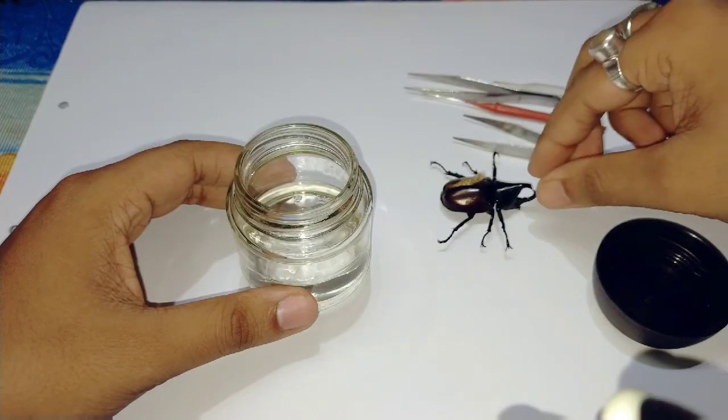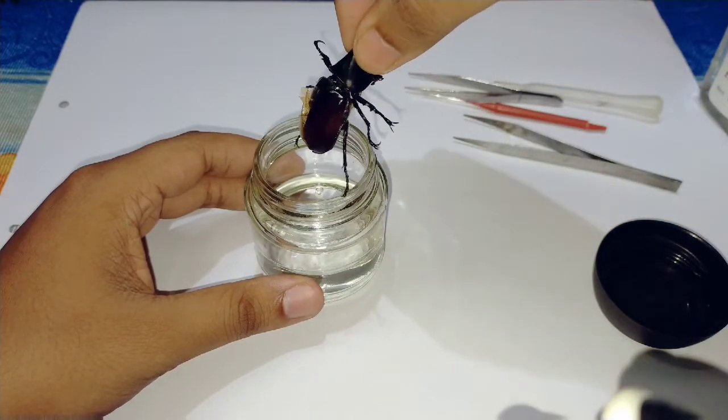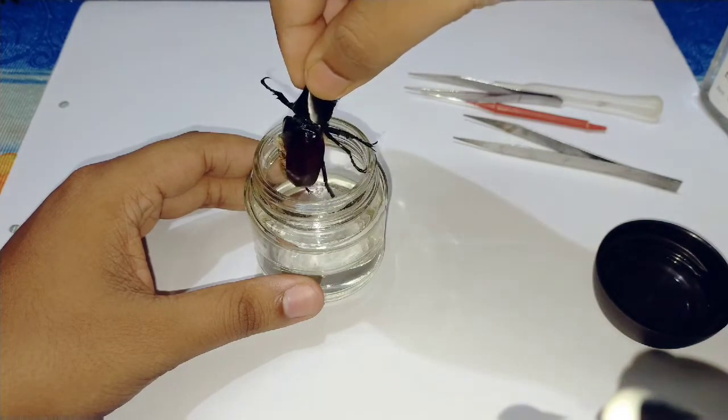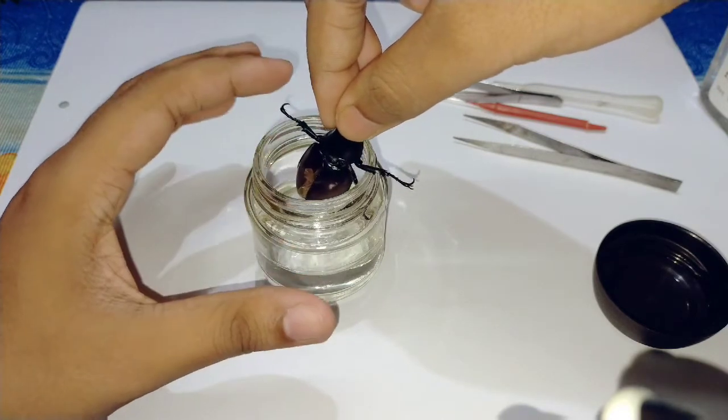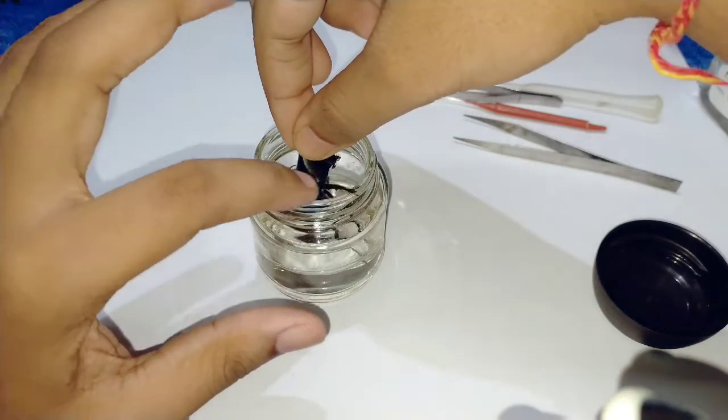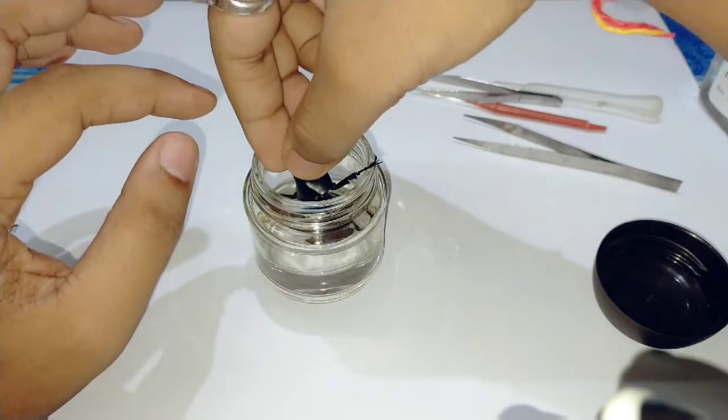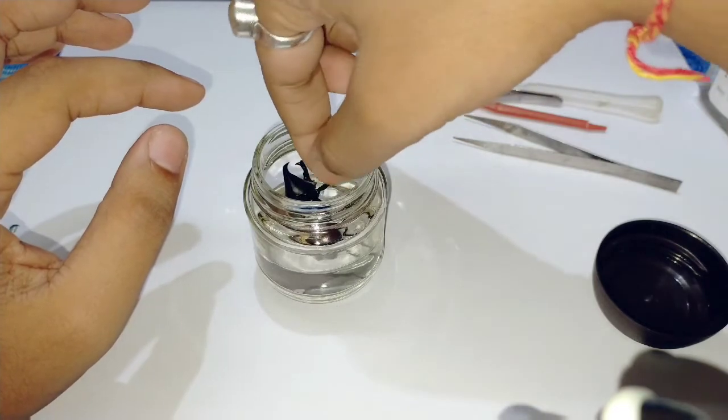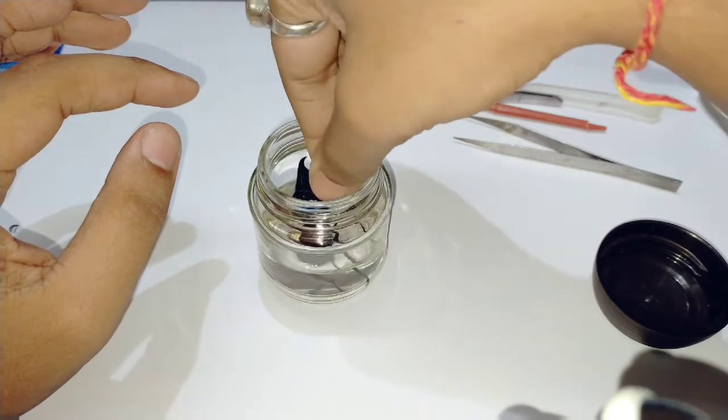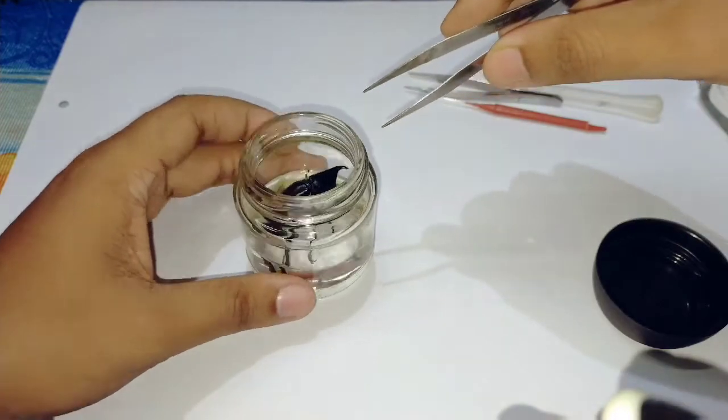Now take the insect and put it in the container, this half-filled container. Put the insect very slowly. Now take it in the container with the help of the forceps.